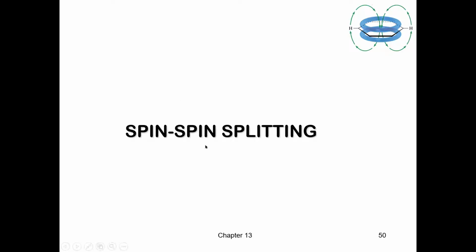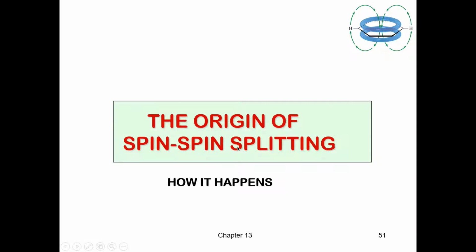The spin splitting. Well, we shall see now what is spin splitting, why it happens, and what is the application of this concept, spin splitting, in understanding the nature of the molecule in NMR spectra.